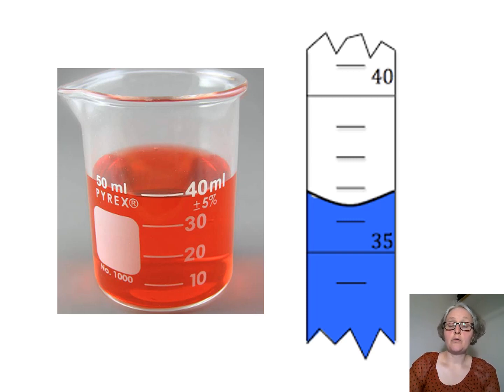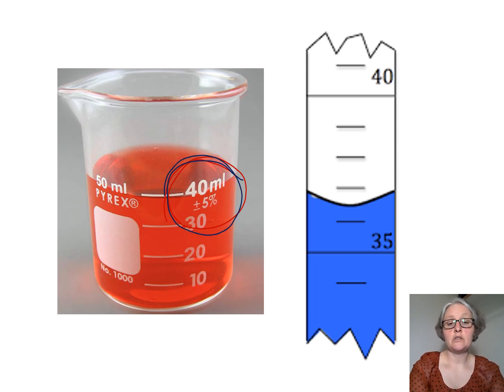Not all glassware items are very accurate. Most of them will list on their surface how accurate they are. So here we've got this beaker, and you can see that its accuracy is only plus or minus 5%.